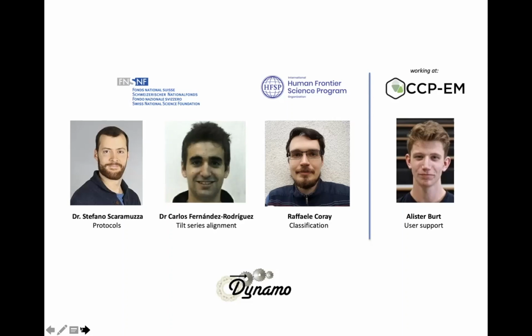Thanks, Pete. Okay, so one of the other questions we had coming in was, again, you touched on this a little, on the computational requirements and the memory requirements for the system. Are there any broad minimums, you would say, or are there any cases where particle size becomes an issue with either system memory or VRAM on the GPU?